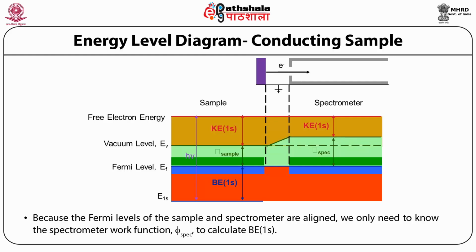For conducting specimens, a fine strip of conducting paint, in addition to the adhesive tape, is all that is necessary to prevent sample charging. Solvent in the conducting paint can cause the pump down time to extend as it evaporates in the vacuum. Alternatively, metal tape with a metal-loaded, that is conducting, adhesive may be used. In the case of powders, the best method is embedding them in indium foil. But if this is not feasible, dusting them onto double-sided adhesive tape can be a very satisfactory alternative.